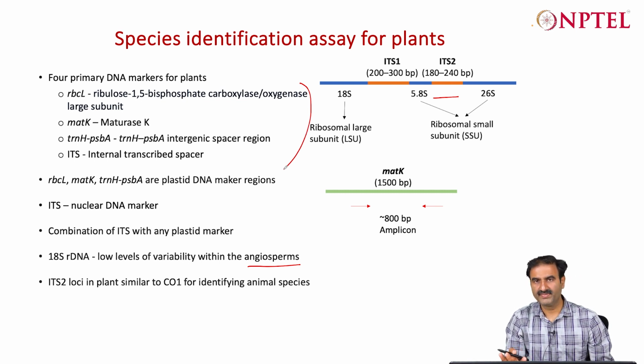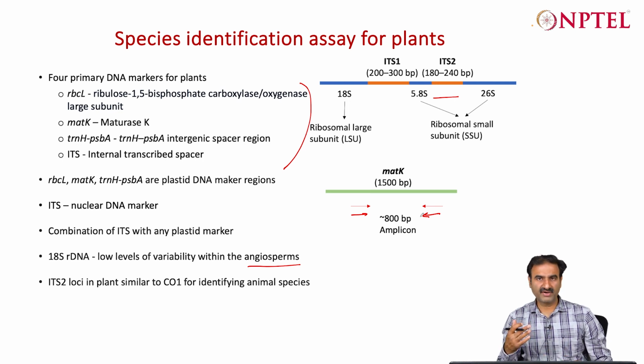So it is better to first decide which genes you are going to amplify, or standardize this for your lab or your work, and then do all the confirmations based on that. Of course, once you have the gene you are interested in, you have to amplify it, so you should have the primers ready, because the product of that gene you will be sequencing by the Sanger sequencing method.